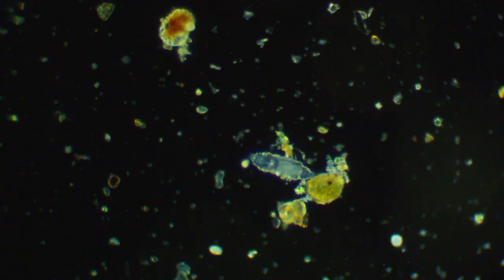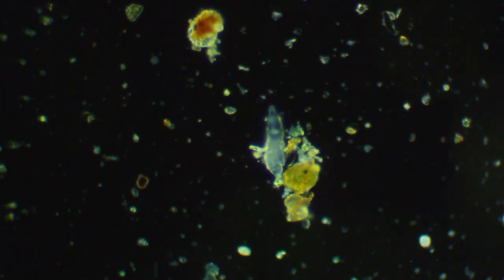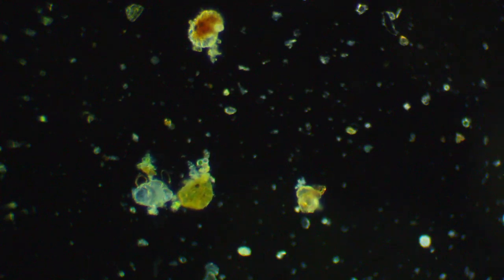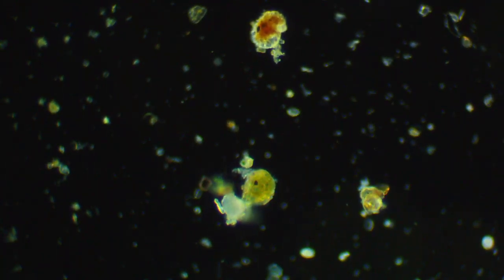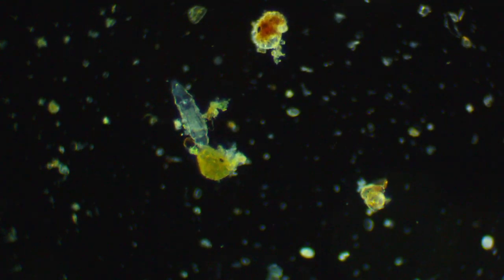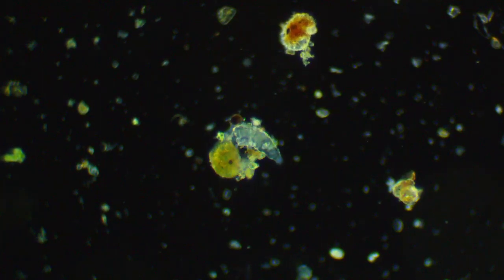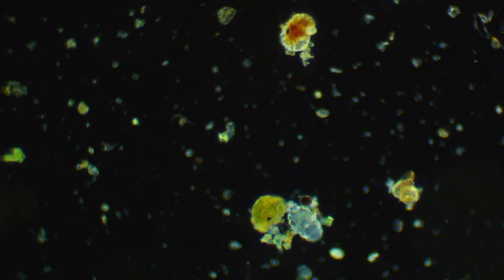I don't know. These rotifers do seem, I mean, you can tell this one here is just dragging things along with it. They're sticky, so they get stuck to things. And I would imagine that at these scales the viscosity is a little bit different than what we would normally expect. But yeah, this rotifer basically looks like he has a giant piece of moss stuck to his butt, and wherever he goes, it just goes with him. I mean, if it happens to be the kind of moss that he likes to eat, he could just turn around and bite that right off, and maybe he's got his food source wherever he goes, I don't know. But yeah, he's got a lot of other junk stuck to him.